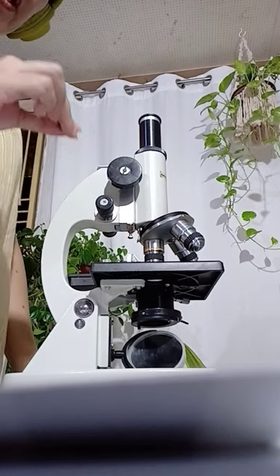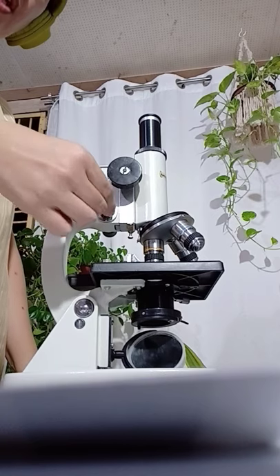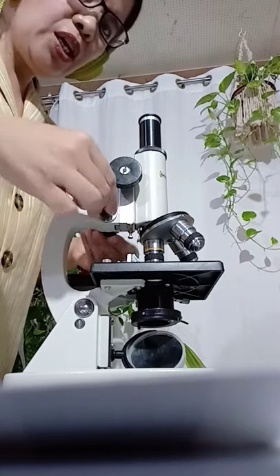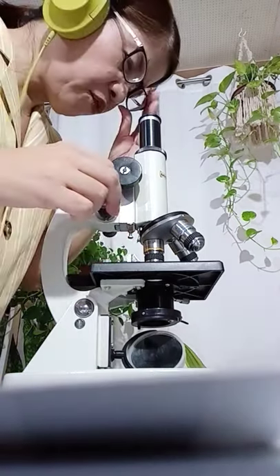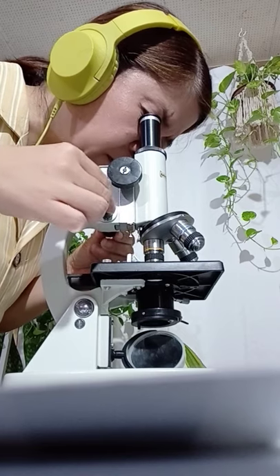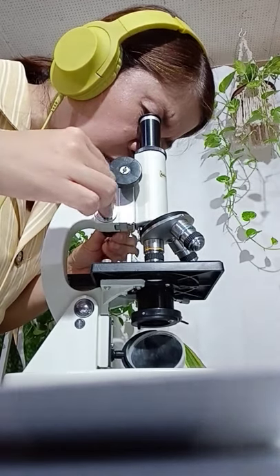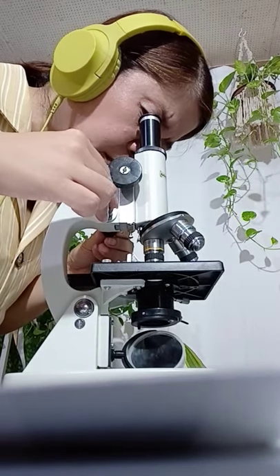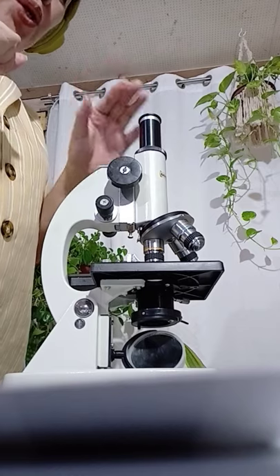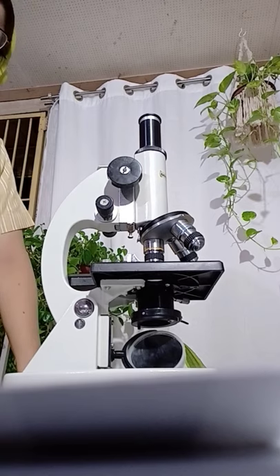To obtain a very clear image of the specimen, you make use of the fine adjustment knob. You can either move it towards you or away from you while looking through the ocular, and that will make the image of the specimen either more blurred or more clear. Once you have obtained a very clear image, you are ready to examine the image you are trying to magnify under the microscope.